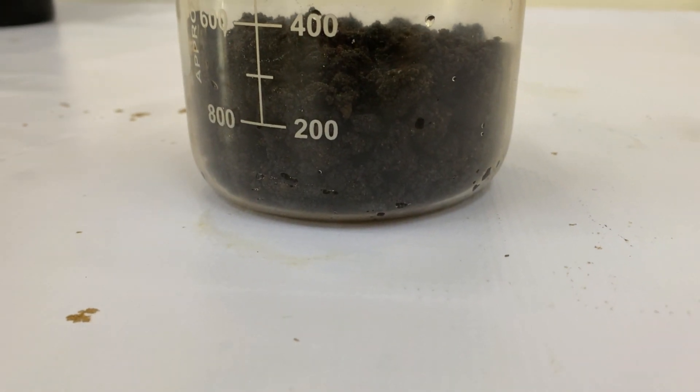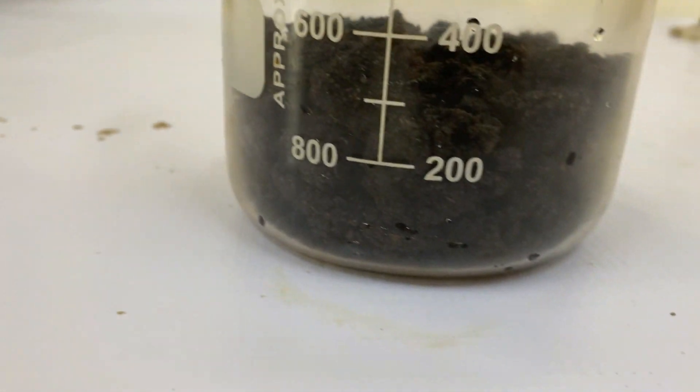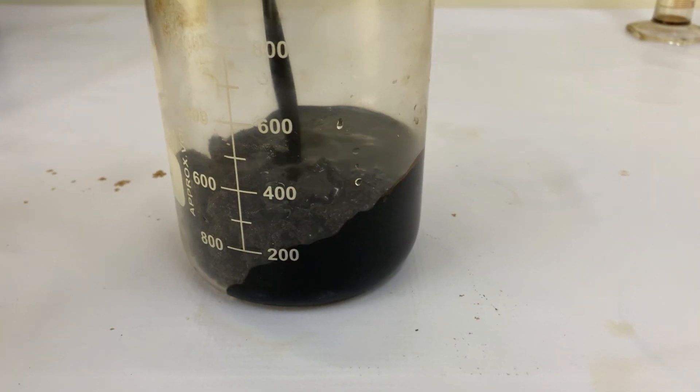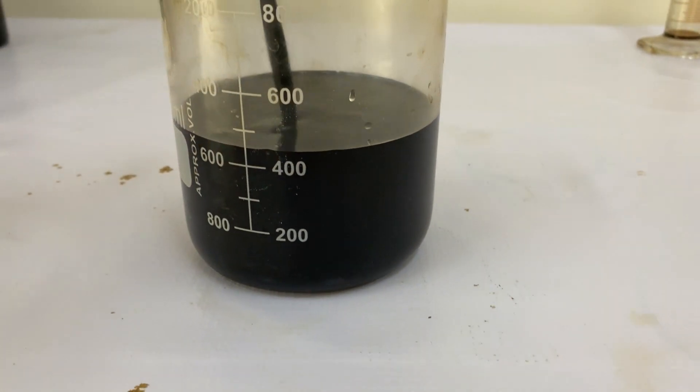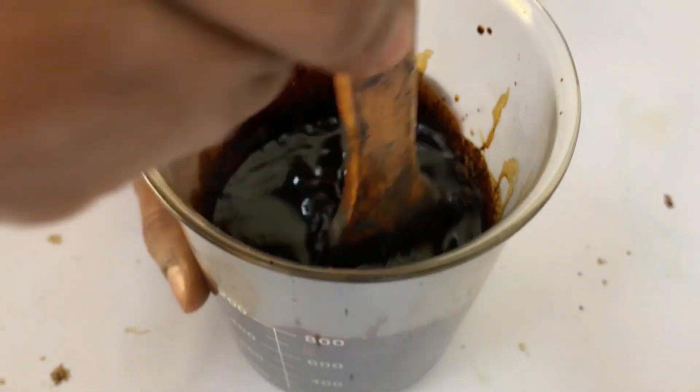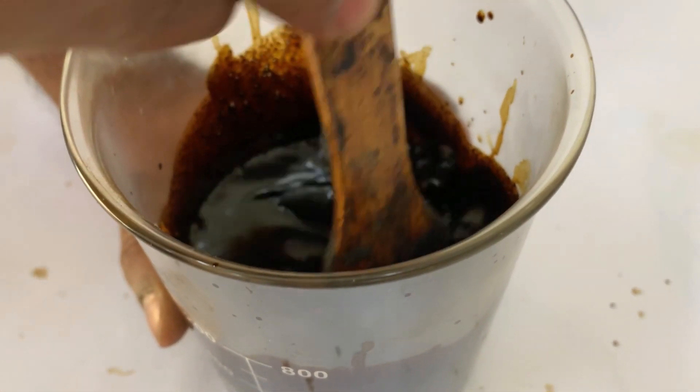We begin with about 300 milliliters of medium-grade oil sand in a beaker. Now we add our BDH agent to the oil sand. Then we simply stir it and let it sit for 24 hours.